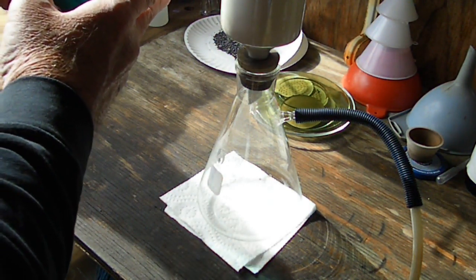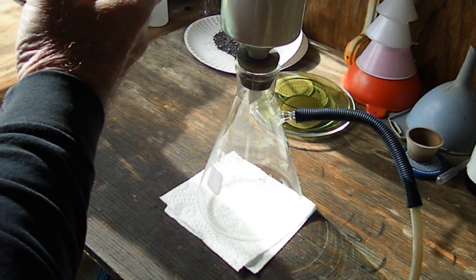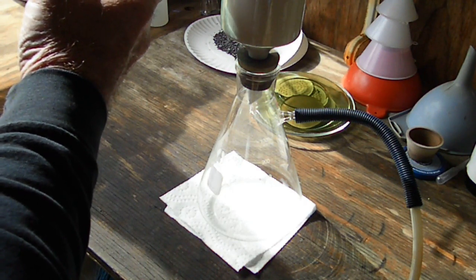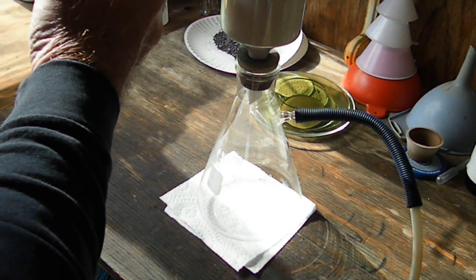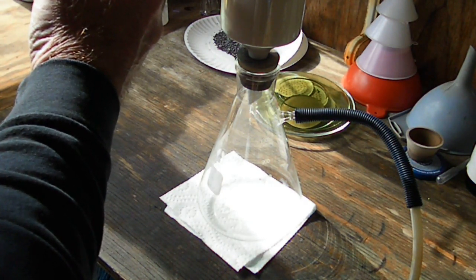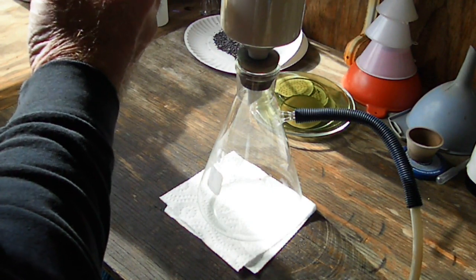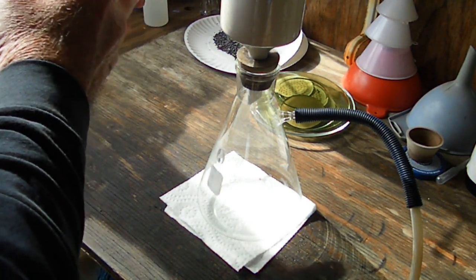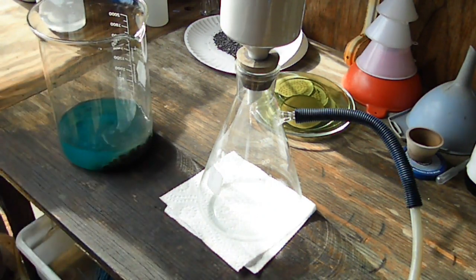I'm going to go ahead and start filtering this off, and we're probably going to need the vacuum when we get down to the bottom. That's why I have it on there. But let me go ahead and try and get as much of this off of here as I can so that I don't end up wearing it. And we'll get back at you when this is done.